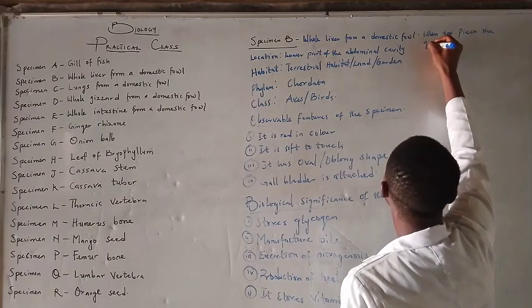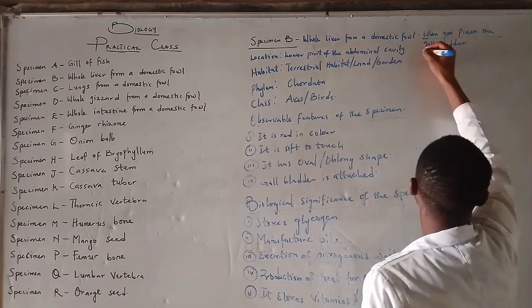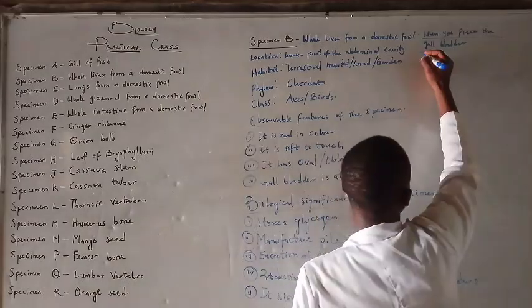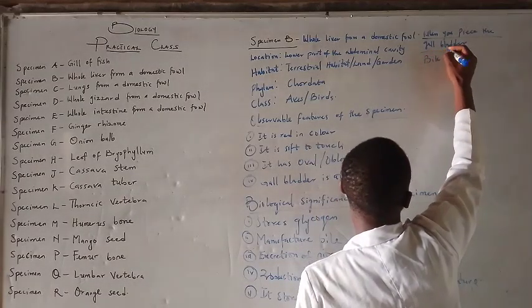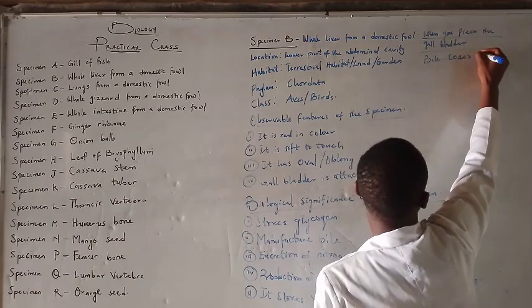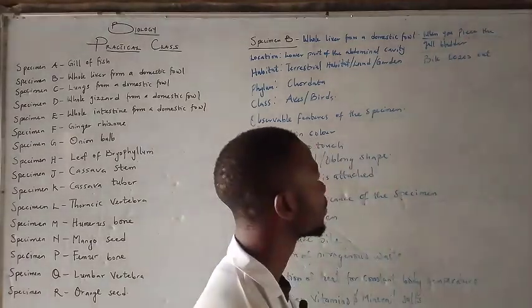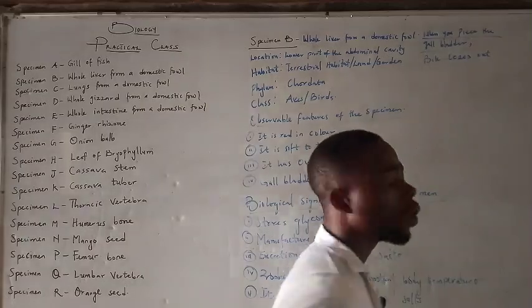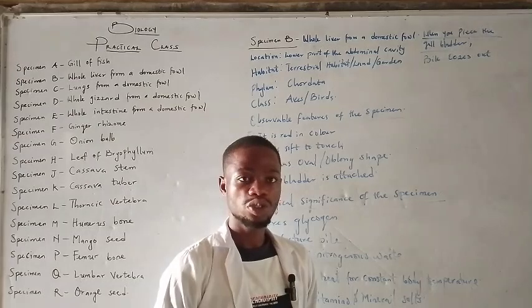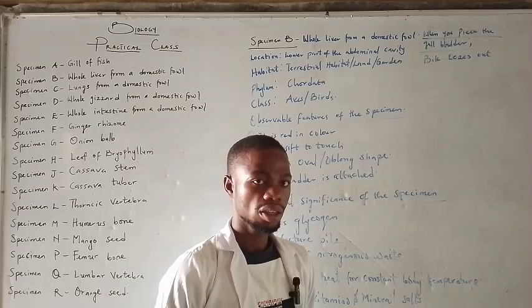When you pierce the gallbladder, the substance that comes out, bile, oozes out. And that bile, you might be asked, because students were said to be given red litmus paper and blue litmus paper.